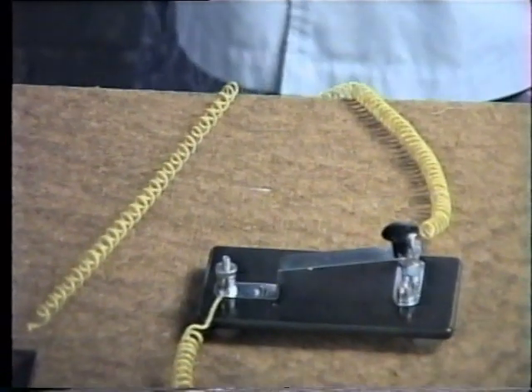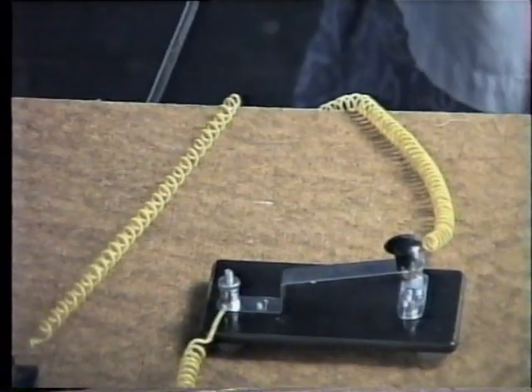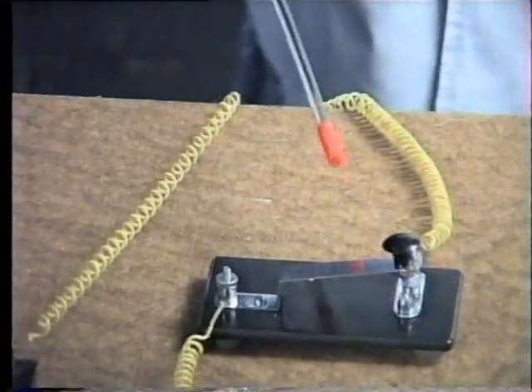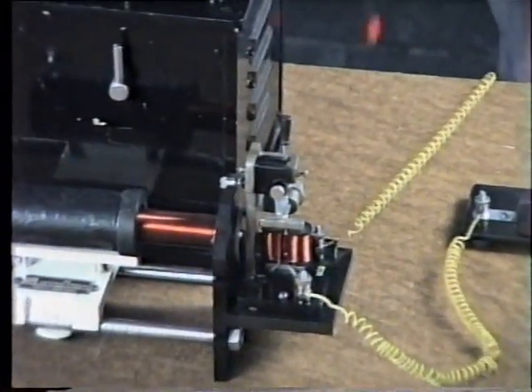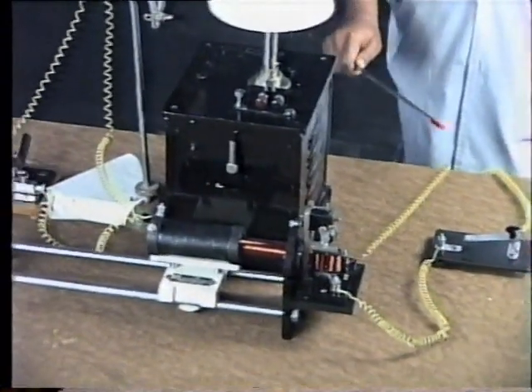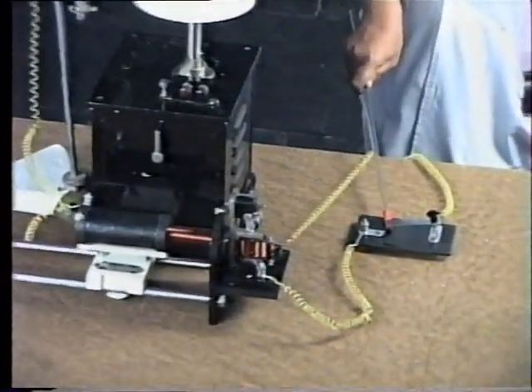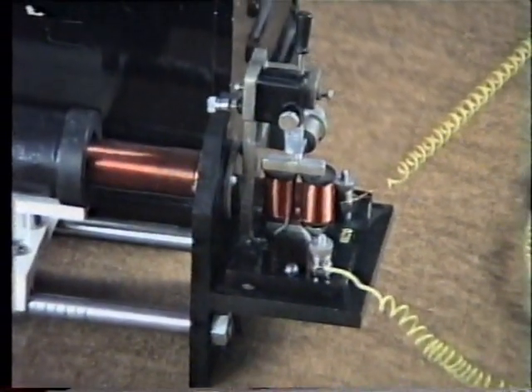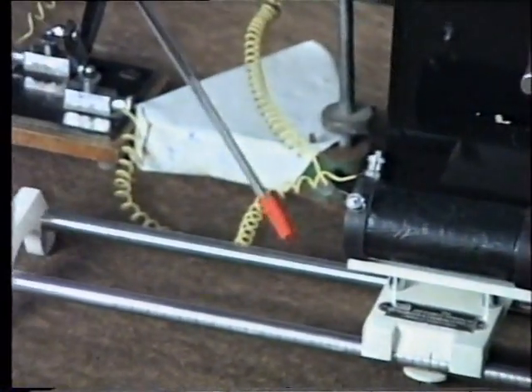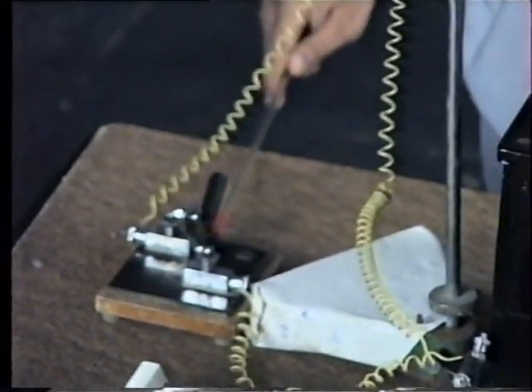These are the instruments used in experimental physiology and their connections. The low voltage terminal is connected first to a simple key, then to the induction coil. In the low voltage terminal there are two terminals; one is interrupted through the simple key to break and make the supply. From the primary coil of the induction coil, connections are made to the secondary coil, then to the tissue chamber through the short-circuiting key.